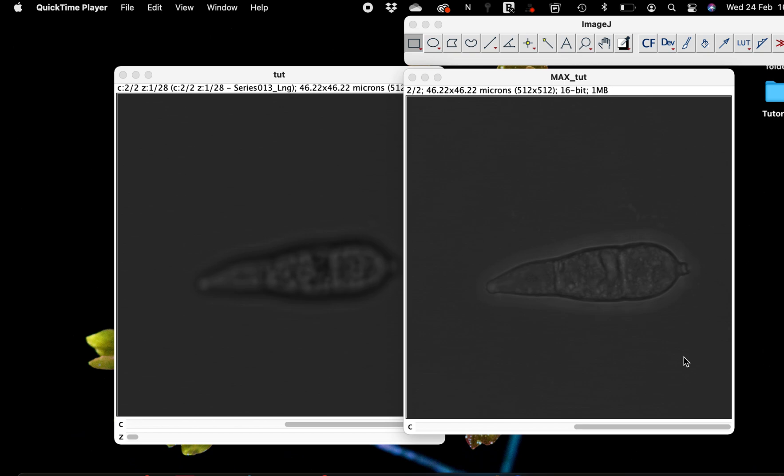Welcome back to my YouTube channel. My name is Alice Rita and today I will show you how to record macro in ImageJ. The purpose of recording macro is to automate your work and also it allows easy reproducibility of your analysis.